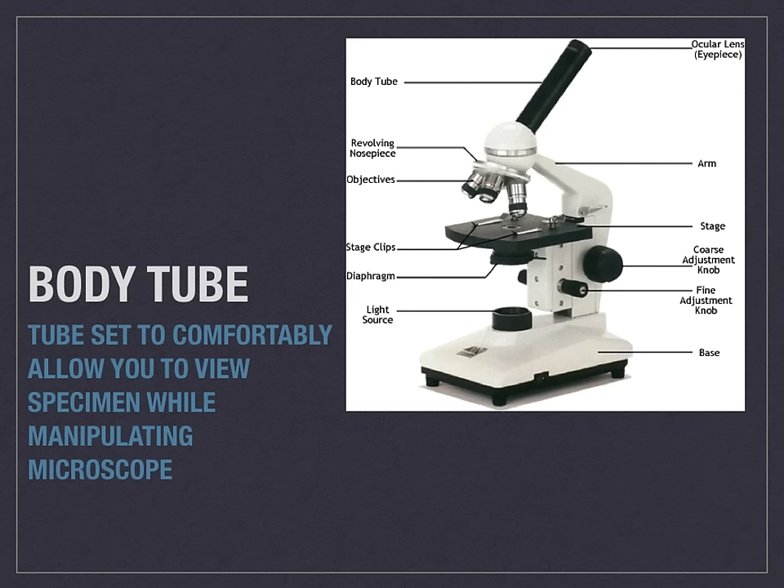The body tube is what allows the lens to set the appropriate distance apart from the actual arm and the objective, so that you can comfortably observe the different specimens while manipulating the microscope.